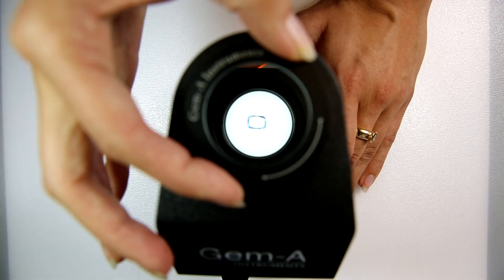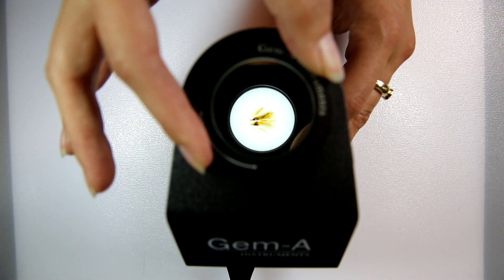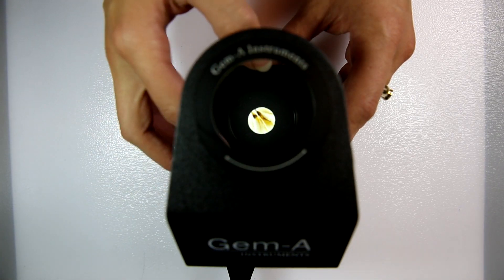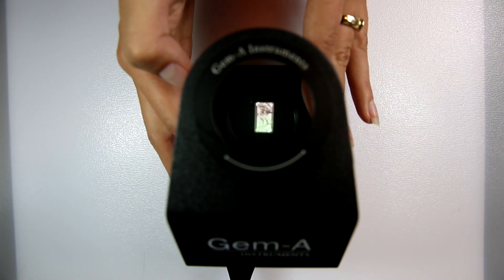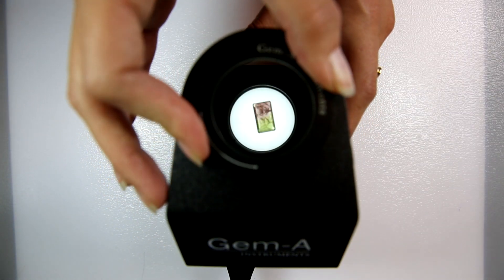To see this comparison in the bench polariscope, turn the top filter to its lightest position and then back again to compare how the gem looks under both crossed and uncrossed filters. For bi-coloured stones or stones with uneven colouration, do not confuse these colour tones with the stone going light and dark. Again, remove the top filter to view how the stone would look in its lightest position so that you can cancel out any colour tone effects from your results.